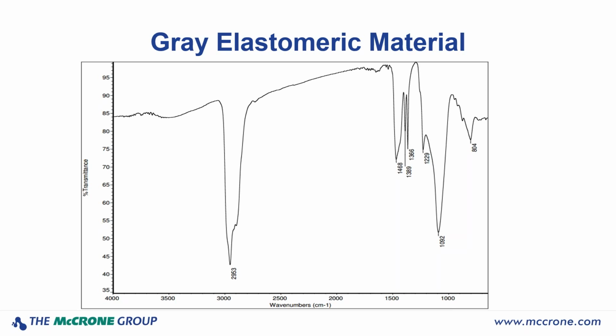We could re-prepare the sample or correct the baseline to even things out. And while severe scattering can interfere with spectral matching, what we're seeing here is mild scattering, and that doesn't interfere with the match. So we can go ahead and see what a database search tells us.